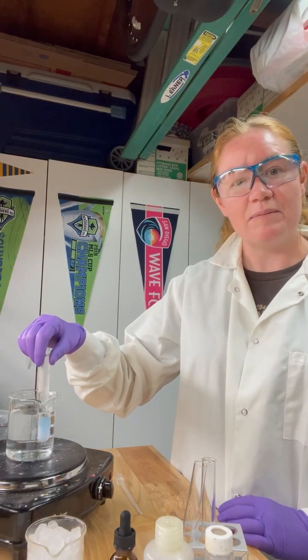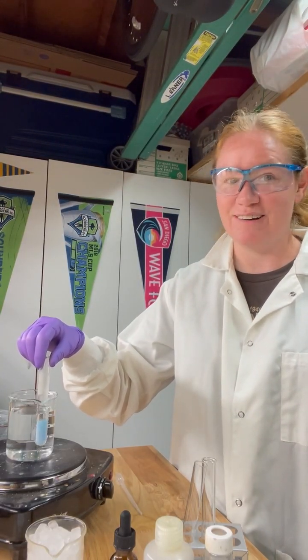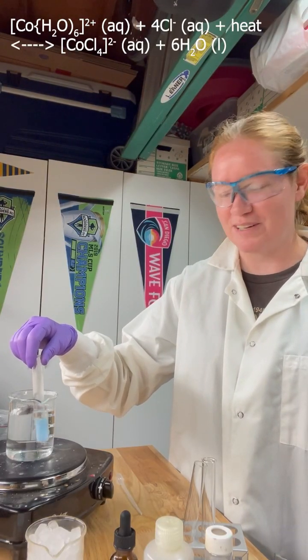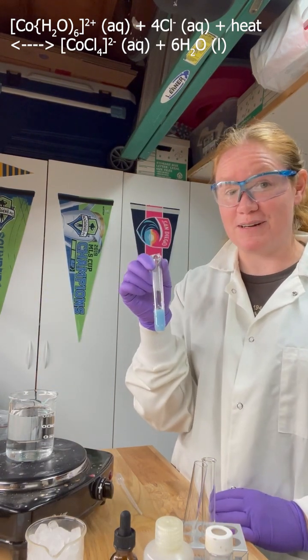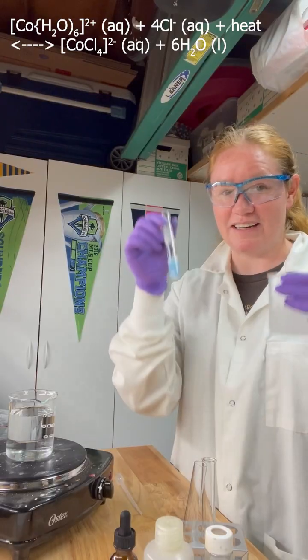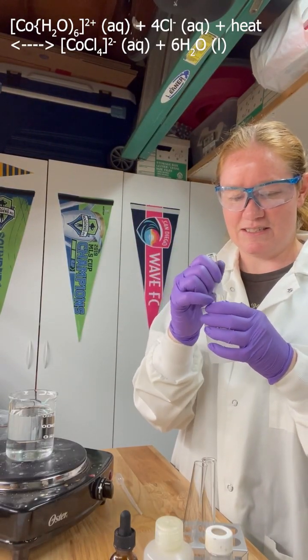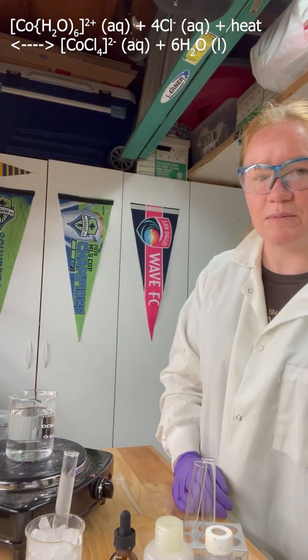It's returning to blue. Okay, so if we're getting blue as we heat it up, that means that heat must be a reactant, because adding excess heat is now shoving our equilibrium back toward our products. Okay, so this is an endothermic reaction if heat is a reactant. Which means that if I remove heat from my system, i.e. by dunking it in an ice bath, what color should we get? Should it stay blue, or do you think we'll see a return to the pink? That's going to take a moment, so I'm going to leave it there.